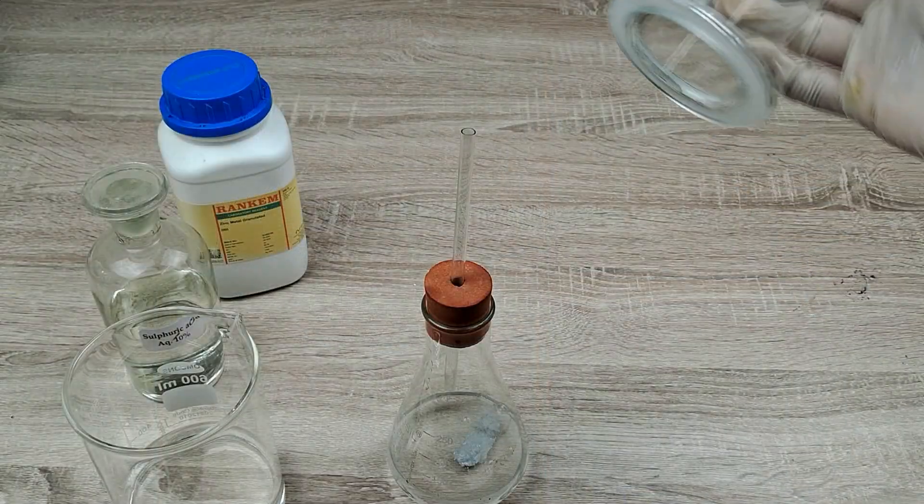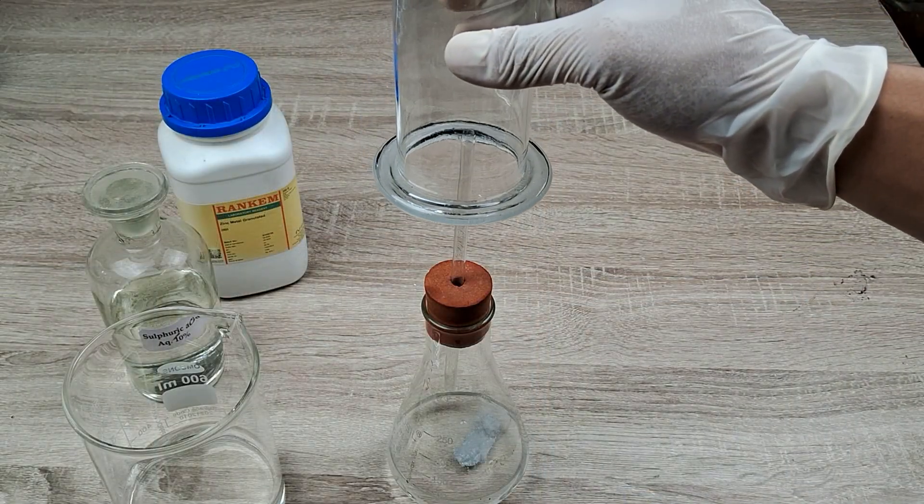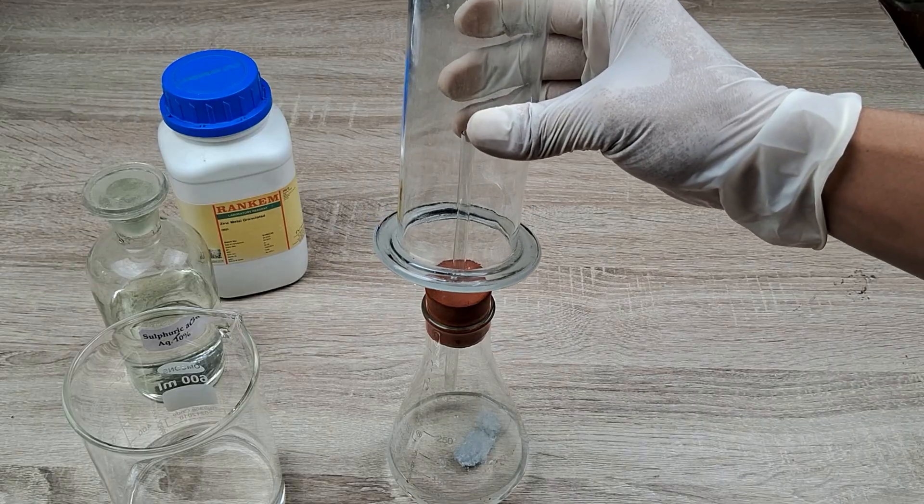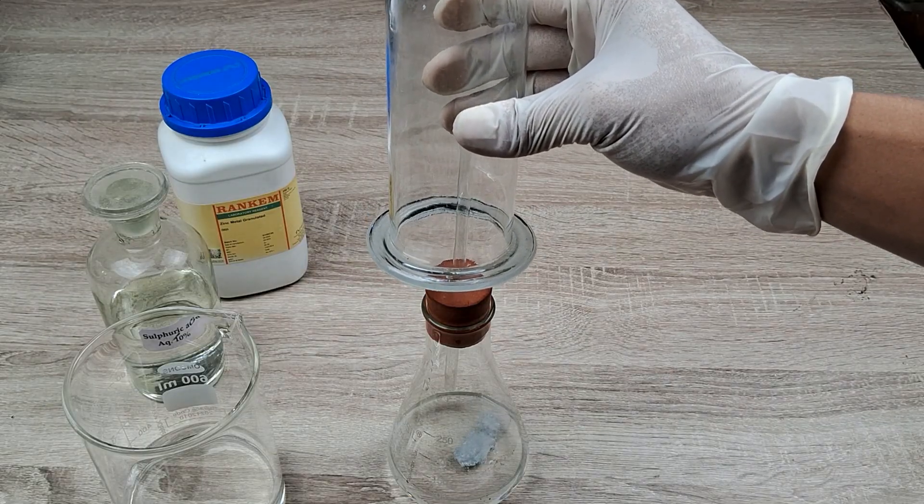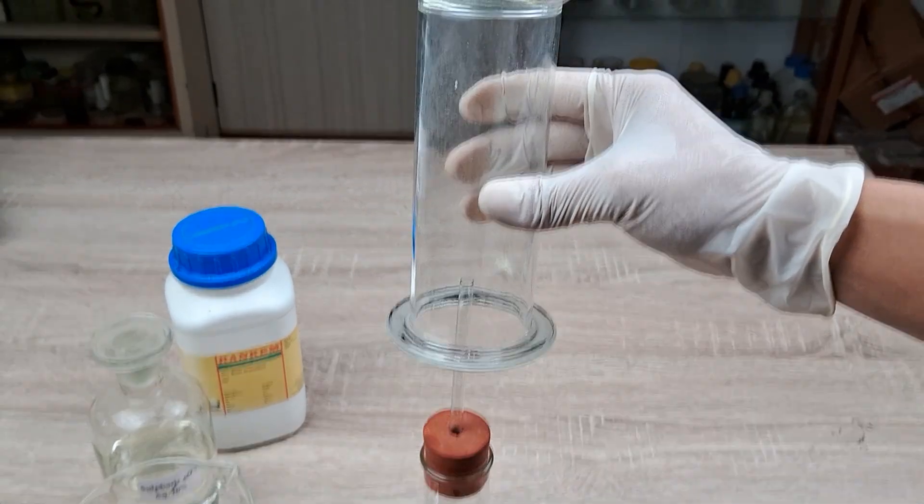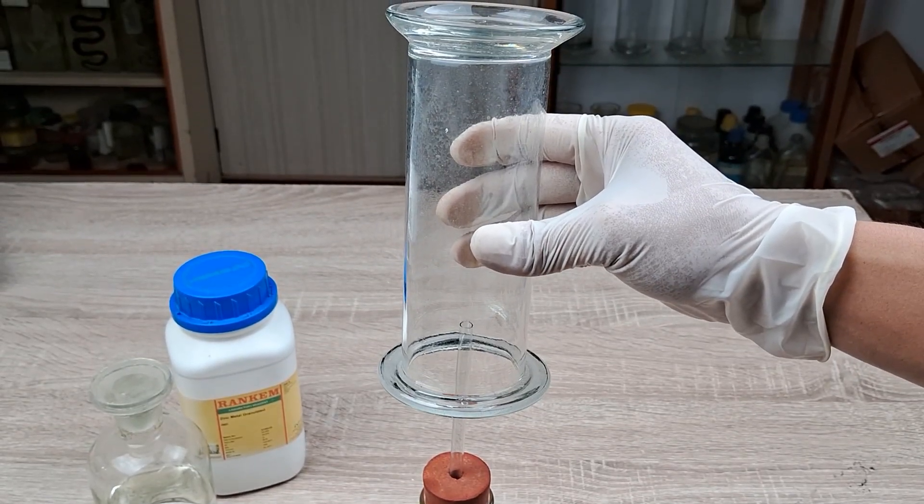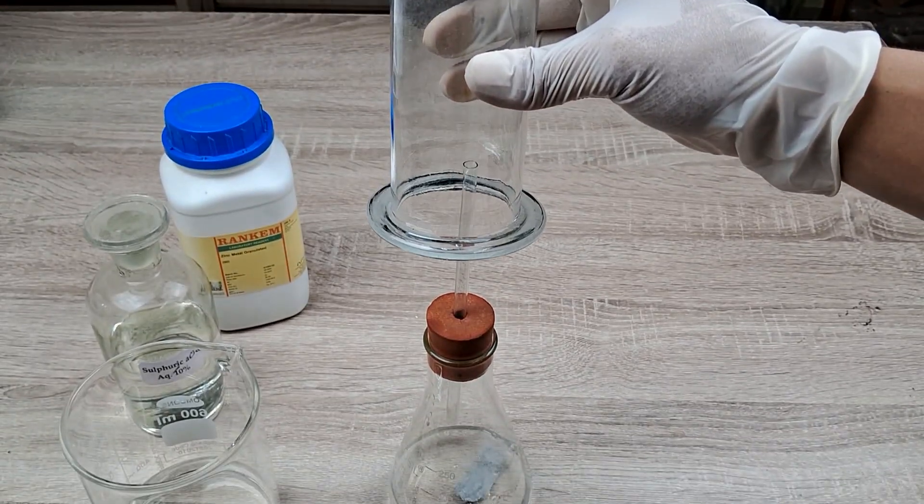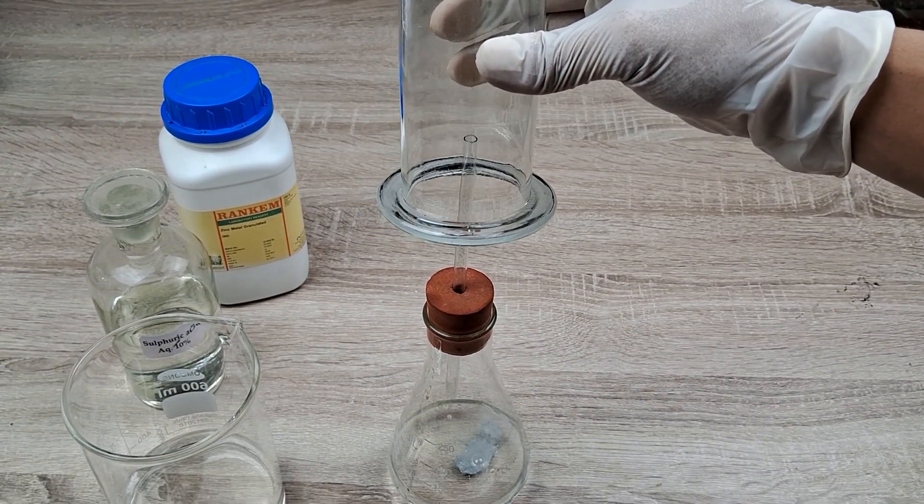After 30 seconds to a minute, hold the gas jar in the inverted position over the end of the tube in such a way that a few centimeters of the tube goes into the mouth of the gas jar. Collect the hydrogen gas in the inverted gas jar for about 1 to 2 minutes, by which time the jar would have been fully filled with the hydrogen gas.